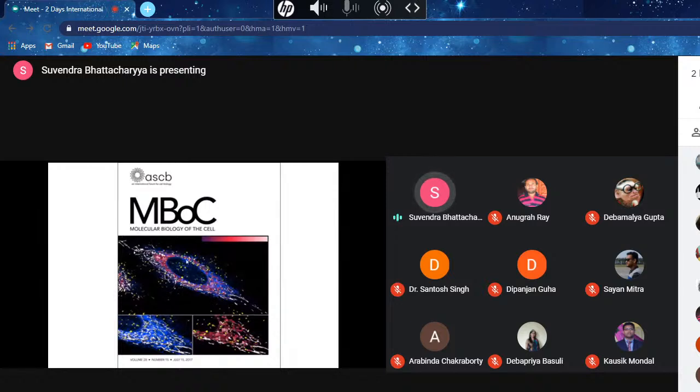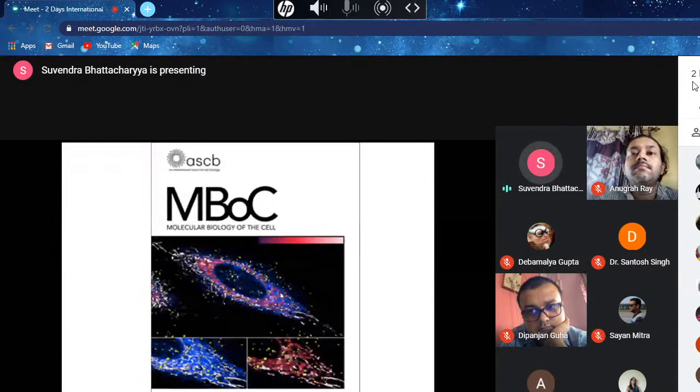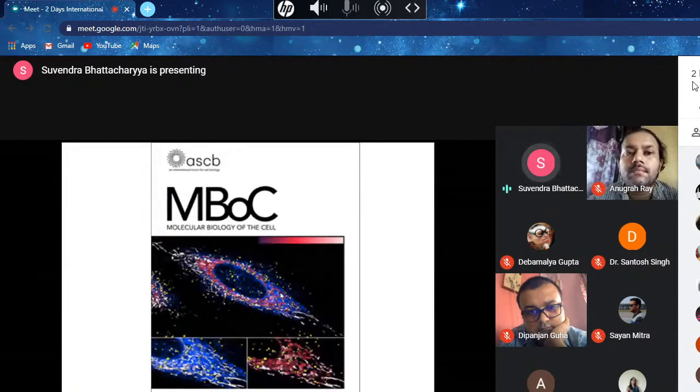Like for example, this white part is representing the ER-endosome or ER-mitochondrial interaction affecting the microRNA effect and microRNA activity. So that's the nutshell of how the techniques that we have used, live cell imaging, time-lapse imaging, and multi-color imaging of the same cells with high resolution, can lead us to this question.